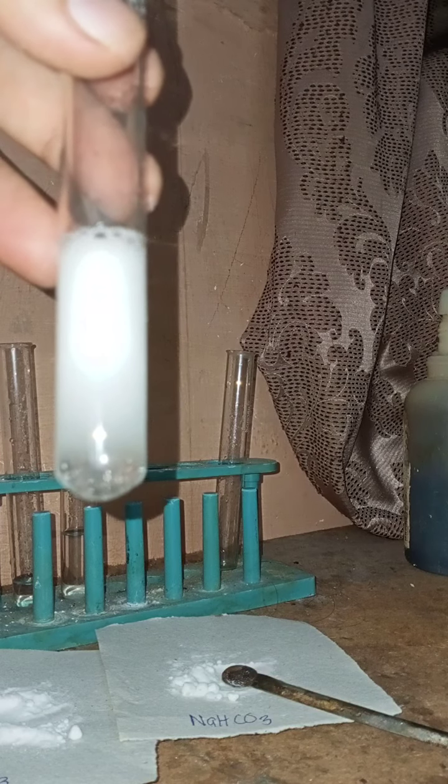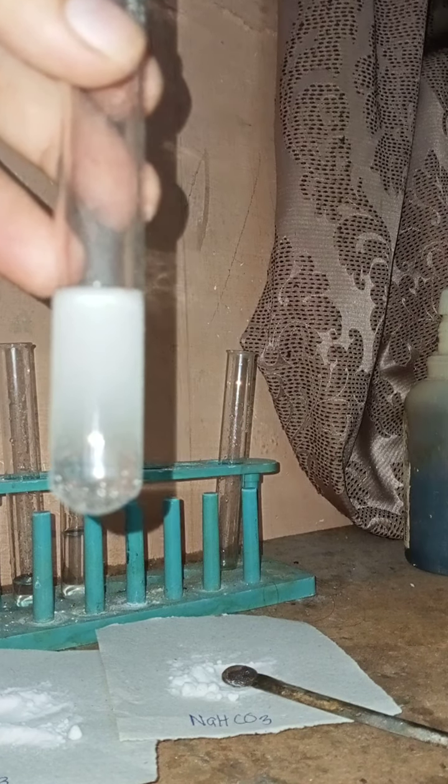We shall add a drop of acid so that we can see the reaction well. You can see the effervescence of the carbon dioxide gas that we can easily see. So this is how we can see the effervescence of carbon dioxide gas.